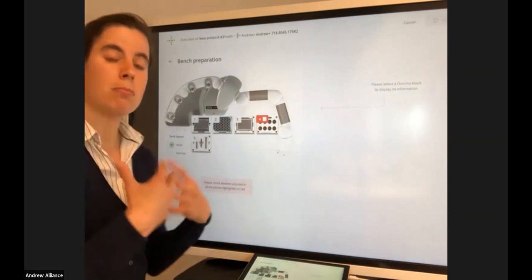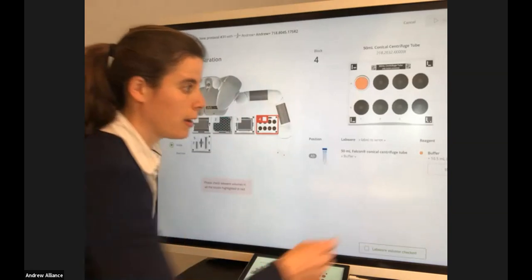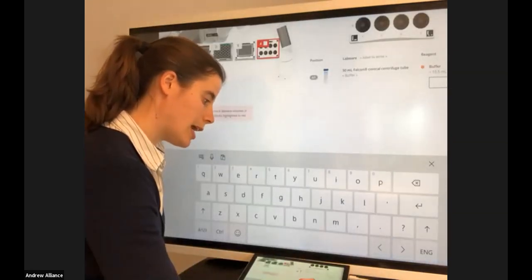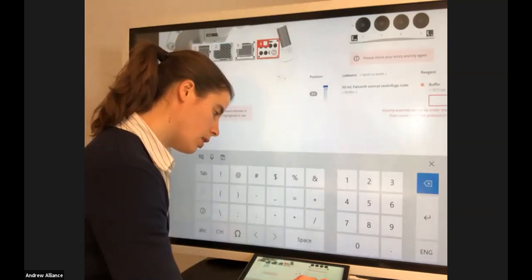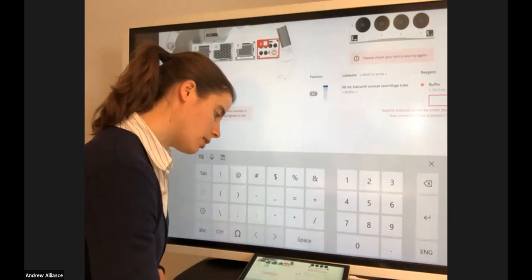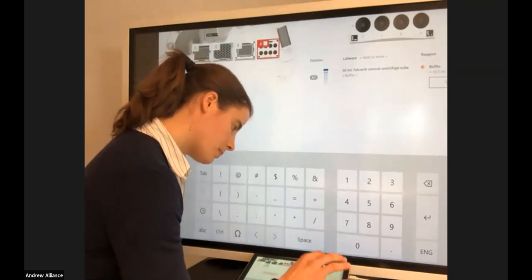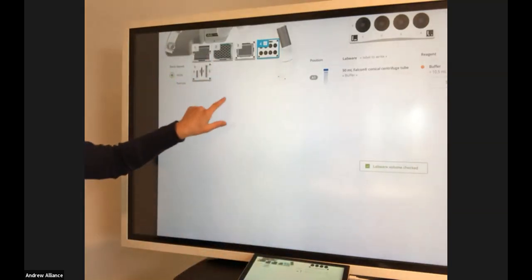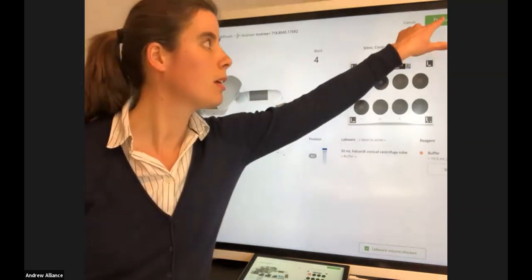One is red. This means that I actually have to input the volume I have in my buffer. In this case, this is the minimum volume that I need. And you'll see later on that I actually have a bit more. So I'll just update this to, I'll have 50,000. There we go. I checked it, perfect. And we're all good to go. Then go back up. Now we can click on Start Experiment.